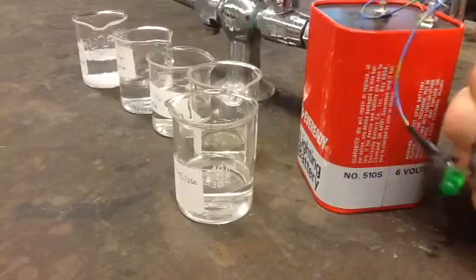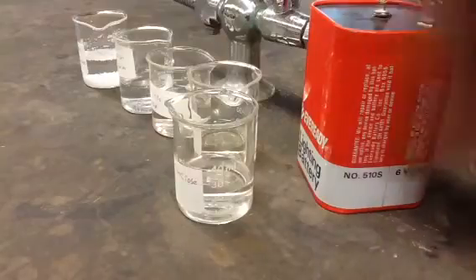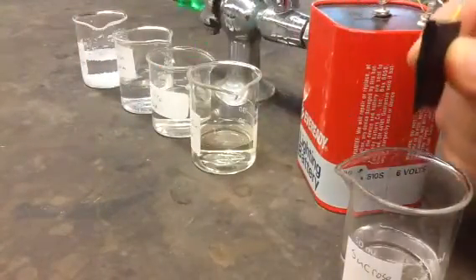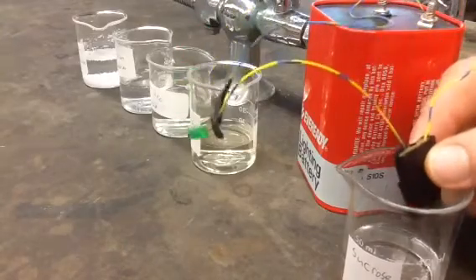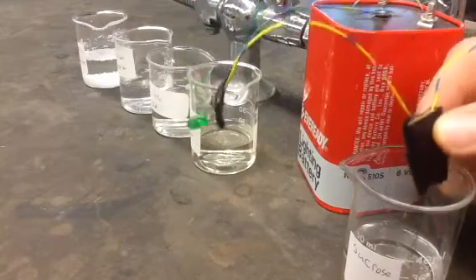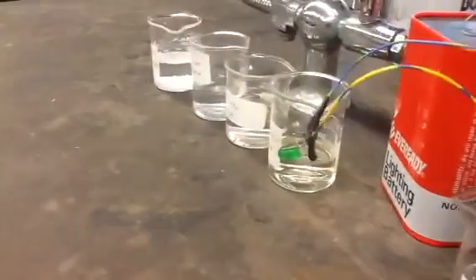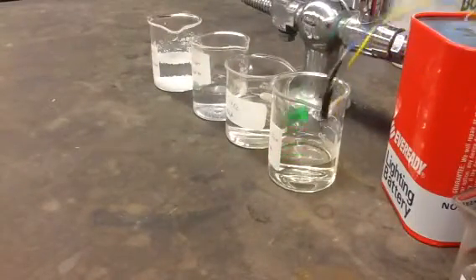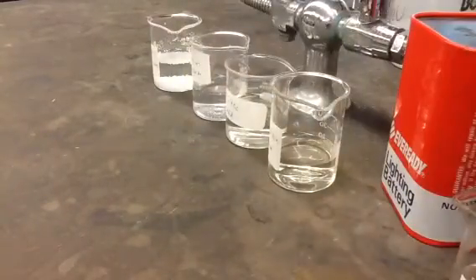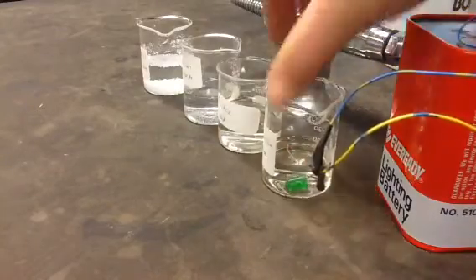Give those a quick dry as I break my sophisticated, high-tech, expensive solubility or conductivity apparatus. Okay, so this is our sucrose solution, and we put the lights in there and we get nothing. Nada. Big fat zero. So sucrose would be considered non-conductive.